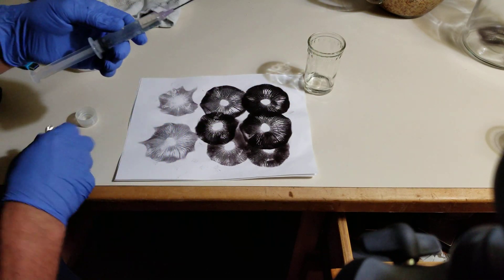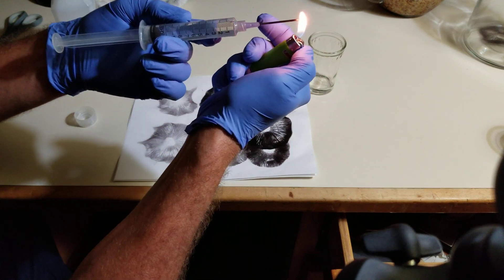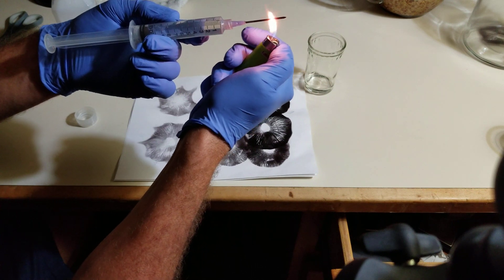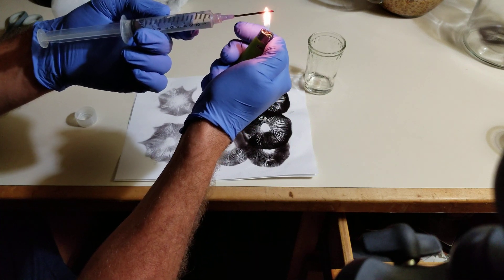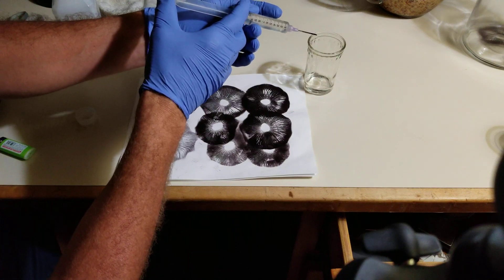First we need to sterilize the needle. It'll turn red. Once it's turned red, it's completely sterile. It's actually incinerated anything on that needle.